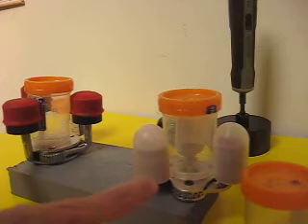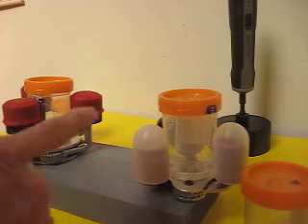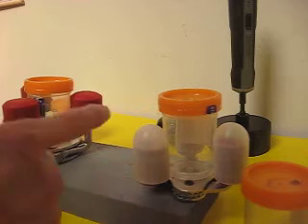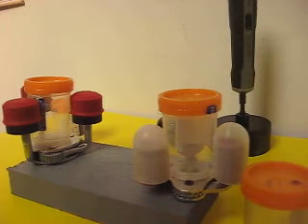Those two look different but we are investigating which one is better. But they do the same similar function: immobilize the caps.